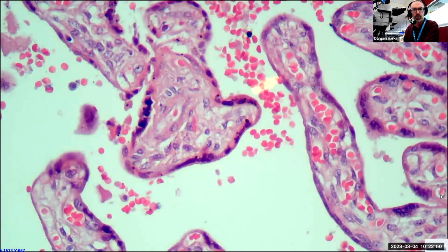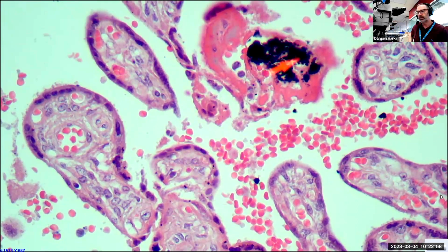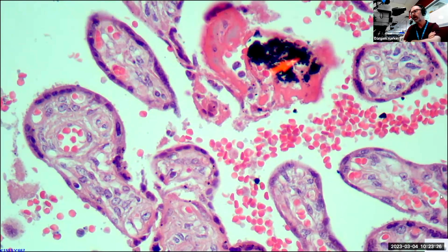But in a number of cases, where there's a lot of formalin pigment in an area like this, it could in many circumstances be detrimental to clearly observing structures of interest to either a researcher or a pathologist, and it just doesn't look nice. Obviously it indicates something about the technique that has been used.